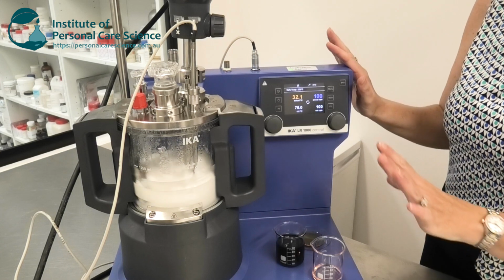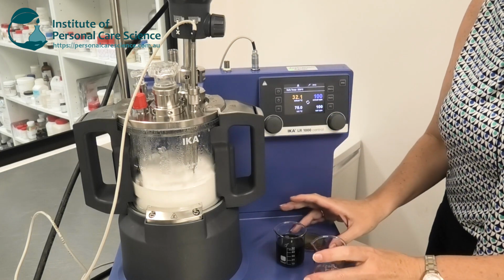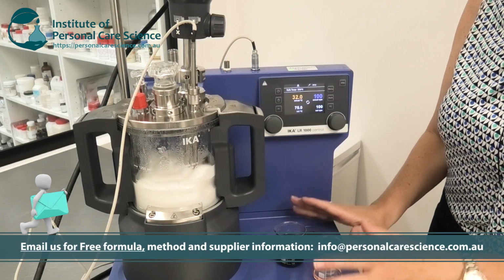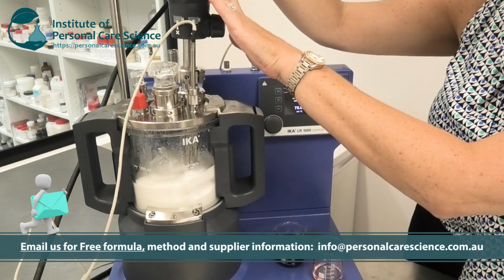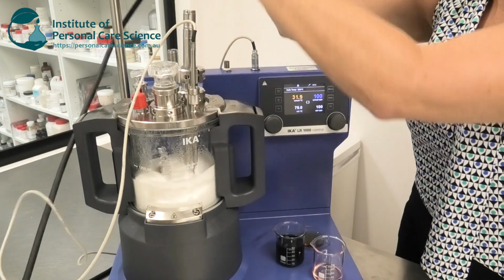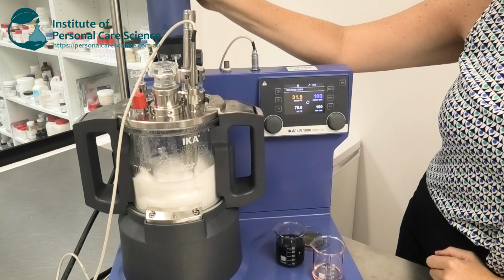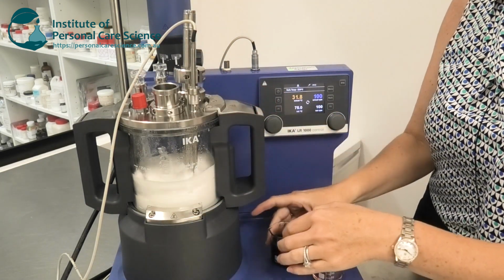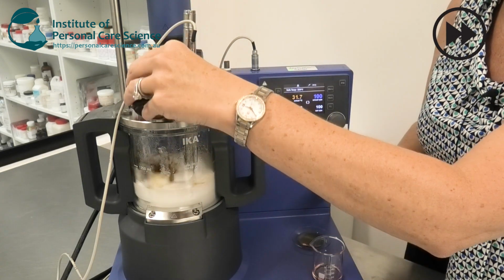Now that my product has cooled below 40 degrees, I can add my final ingredients that need to be added in the cool down phase. At the moment, you can see my IKA Ultra Turrax is still attached, and you might think, isn't that going to be difficult to remove? Not at all. We just lift it off and put it on its little handy stand at the back. I can also remove this stopper, and then I can simply add my additional materials.